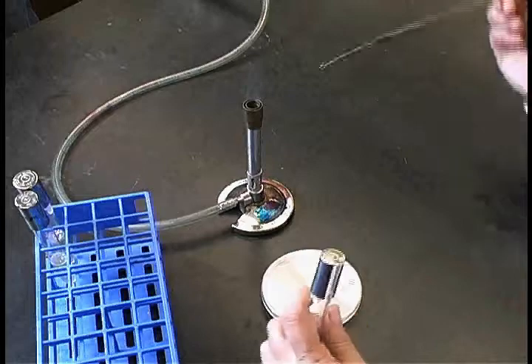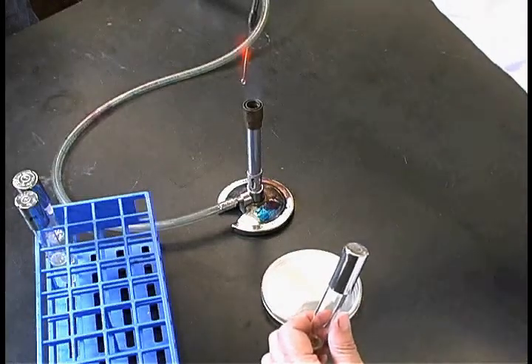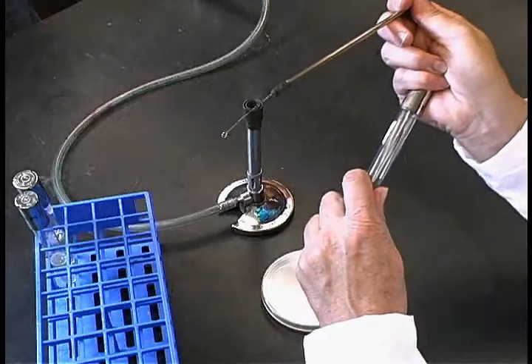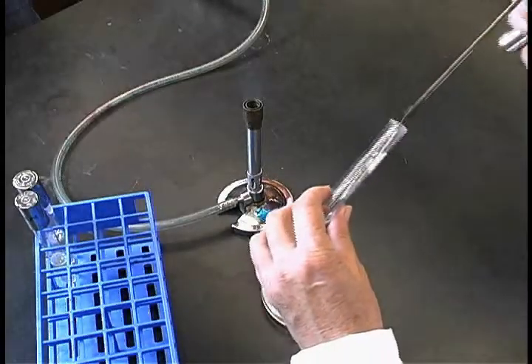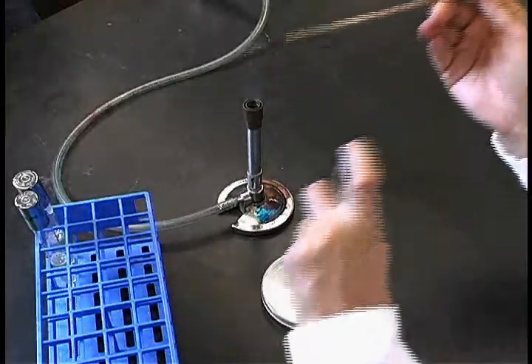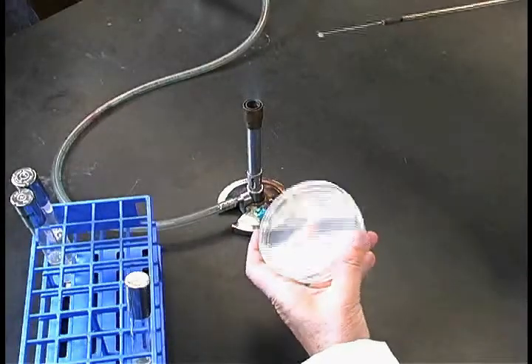To streak a plate for isolation, pick up the test tube in your non-dominant hand and remove the lid from the tube using the little finger of the hand that contains the loop. Pick up a loopful of culture, put the lid back on the test tube, and crack the lid of the petri dish.